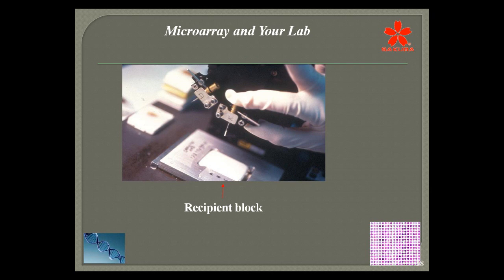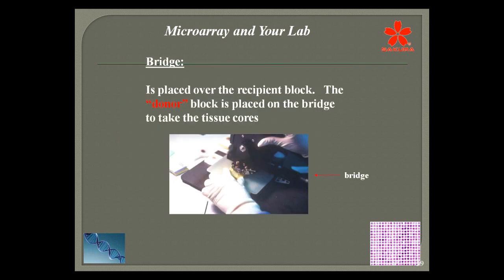You'll actually see the punches, and if you look very closely, you'll see the paraffin that's been lifted out. It looks like a little round core. It's still basically in the edge of the needle. So you would press this needle down. It's hollow, and it will take out a core of paraffin, so it leaves a very nice, precise little hole. And then that's when we're going to add the core of tissue in just a moment.